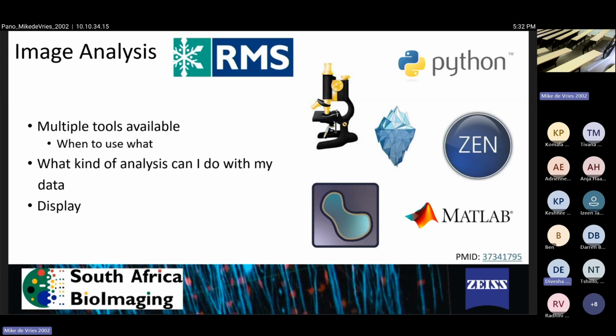But also, what would be nice is if on the web page, people can add standard protocols, which is great. But also, what is the minimum essential information that they can put in? Like exactly what was said earlier. For example, in papers, there's "we used ImageJ" and maybe one or two details, but maybe a bit more like a minimum essential, like magnification, or anything that would define something that would be helpful and reproducible to be carried out.